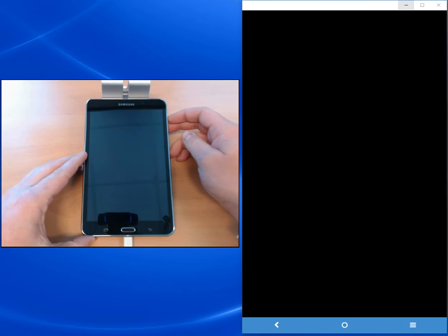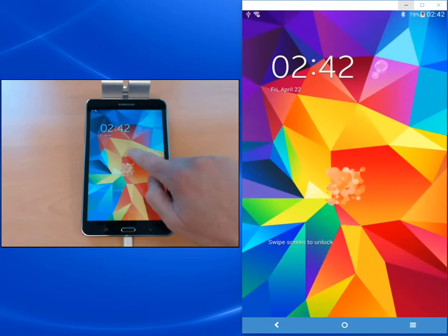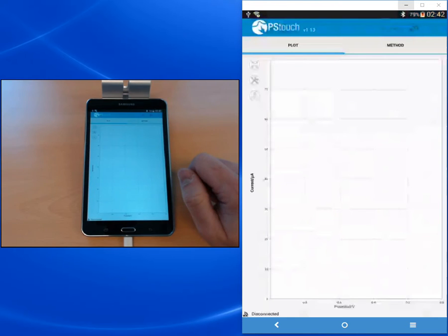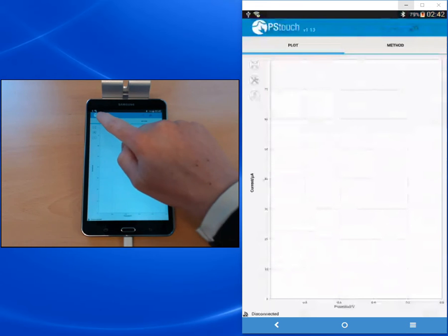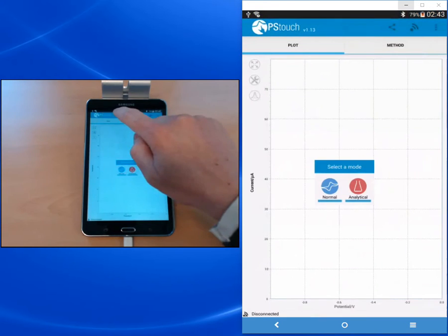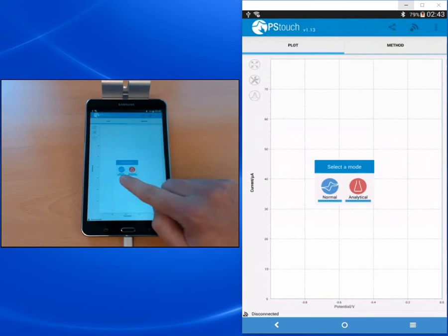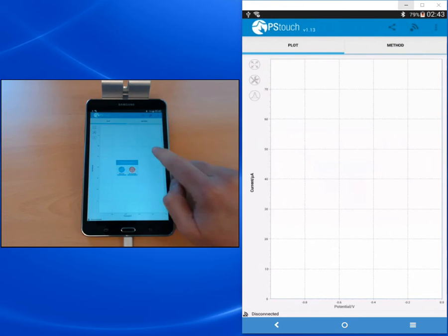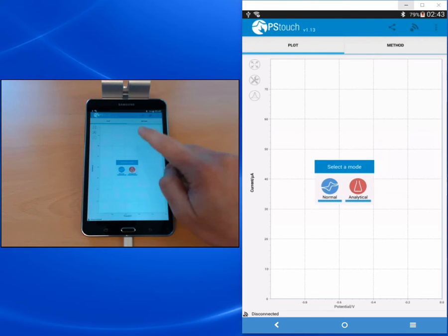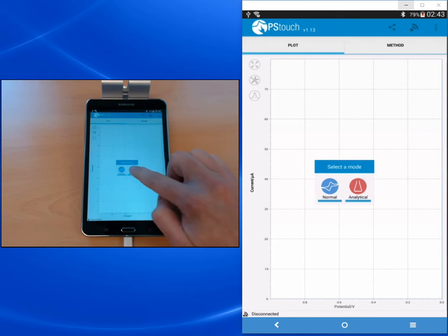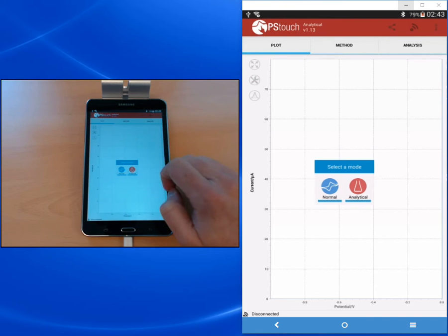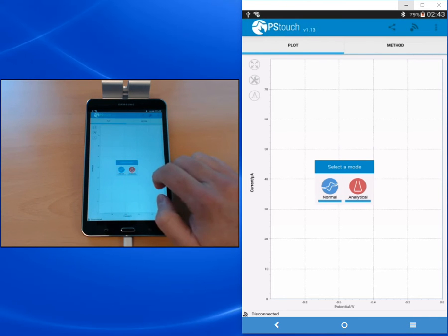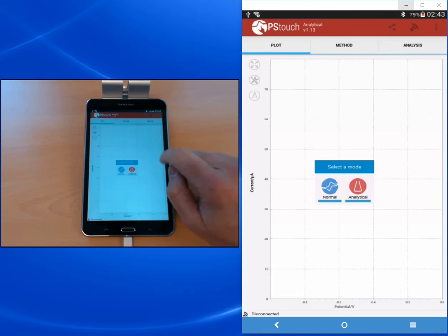After opening PS Touch or even after you've done your measurements, you can switch into the analytical mode. You can do that by touching the logo on the top left and you will get the select mode menu, or you can on the top right choose from the menu the select app mode. When you change the mode, you see that the color of the bar at the top is changing.